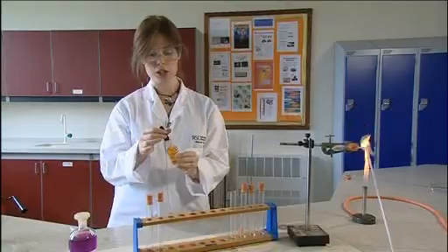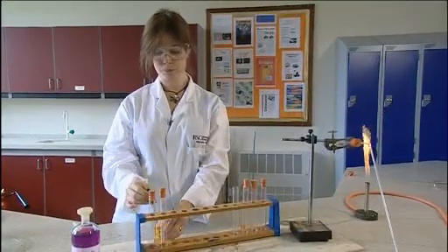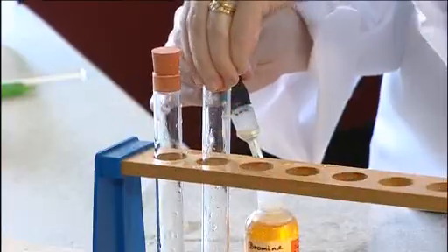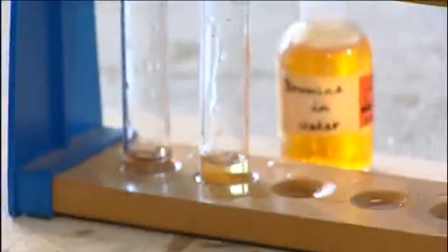To the fifth tube you can add a few drops of bromine water which is just bromine dissolved in water. And shake it up and you can see that the bromine goes colourless. This shows the presence of an alkene or carbon-carbon double bond.